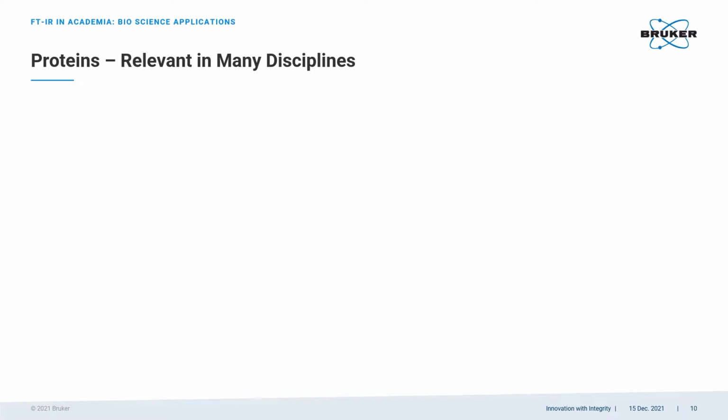Proteins are also a vital part of our daily nutrition, and they are present in higher or lower amounts within the food products we eat each day. For that reason, it is interesting for food sciences and technology to determine the relation of the structure of those food proteins with the resulting properties of the product.